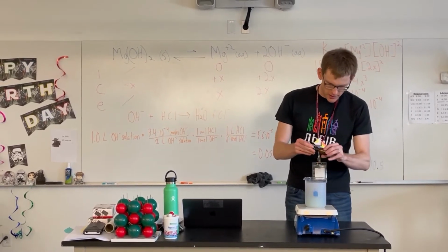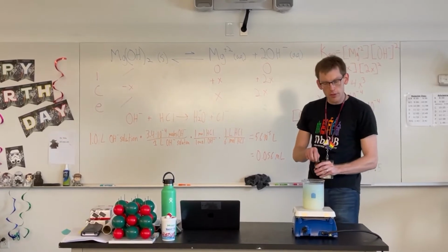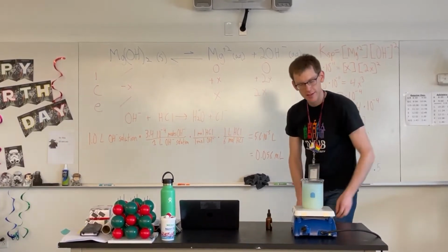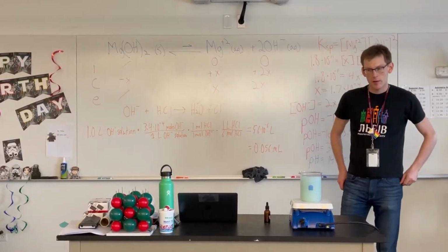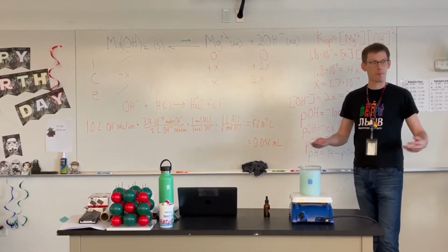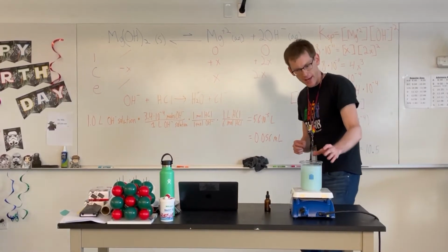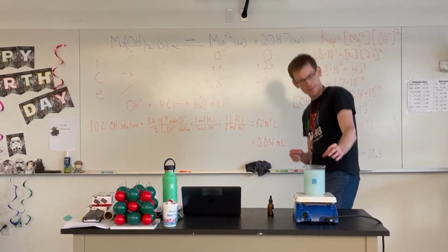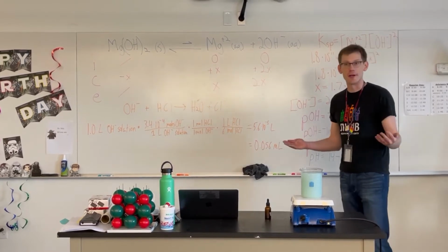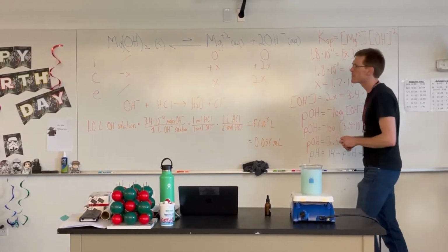And what we'll see is that, whoa, look at the color change. But it came right back. All right, so what happened? Is it still changing? Maybe a little bit. Well, what's going on? Maybe it will continue changing a little bit. It should get right back to where it was.